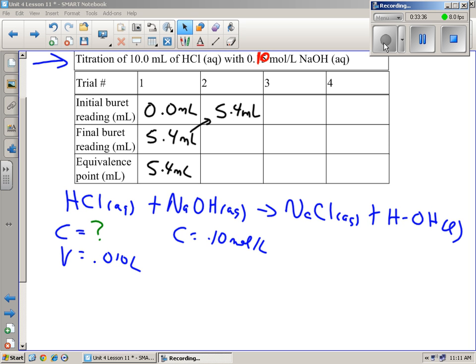Because if you go 1 drop and then you panic and you go like this and that opens it up, not good. It'll be pink in a hurry, okay? And then I hear, oh, right? So make sure you know which way off is. I kind of got 2 drops there. Come on. And I kind of need to get rid of this drop here, because if I don't, that drop's not in the burette anymore. So I got 2 drops on this one. Come on.